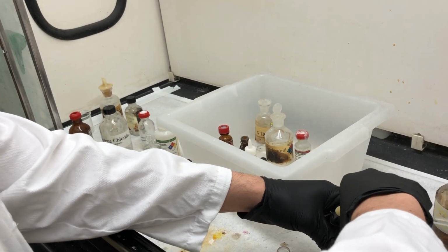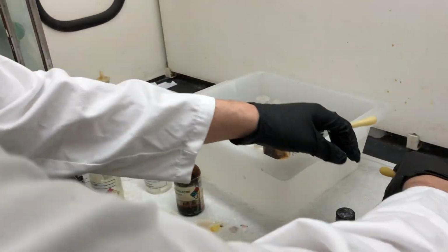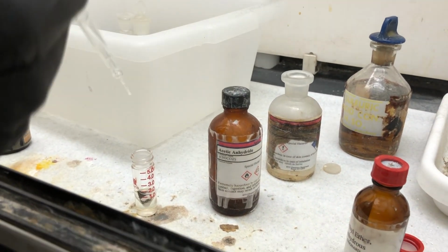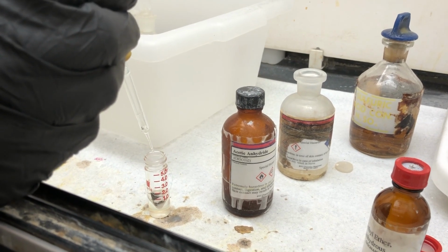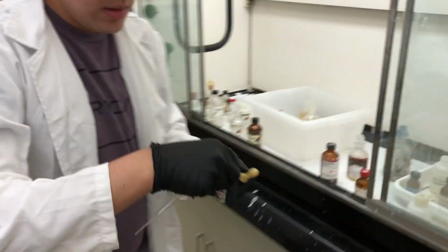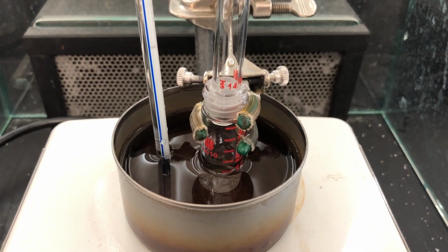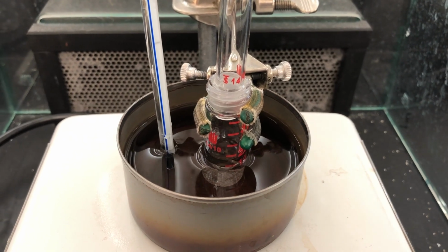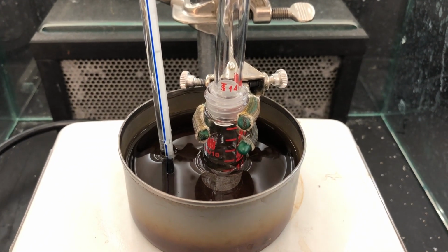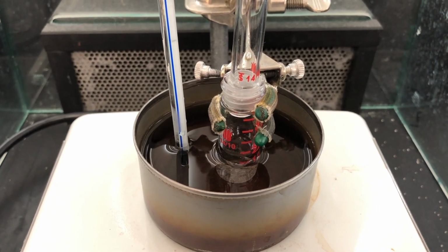And then we're going to add 1 to 2 drops of 85% phosphoric acid with the new pasteur pipette. This is 85% phosphoric acid. 1 to 2 drops of this right into here, so that's 1 and 2. Okay, so we just added the 0.5 milliliters of acetic anhydride and the 85% phosphoric acid. Now we've just placed the conical vial with an air condenser in a 50 to 60 degrees Celsius water bath. Once the solid dissolves, we'll heat it up for about 15 minutes and then we'll continue.